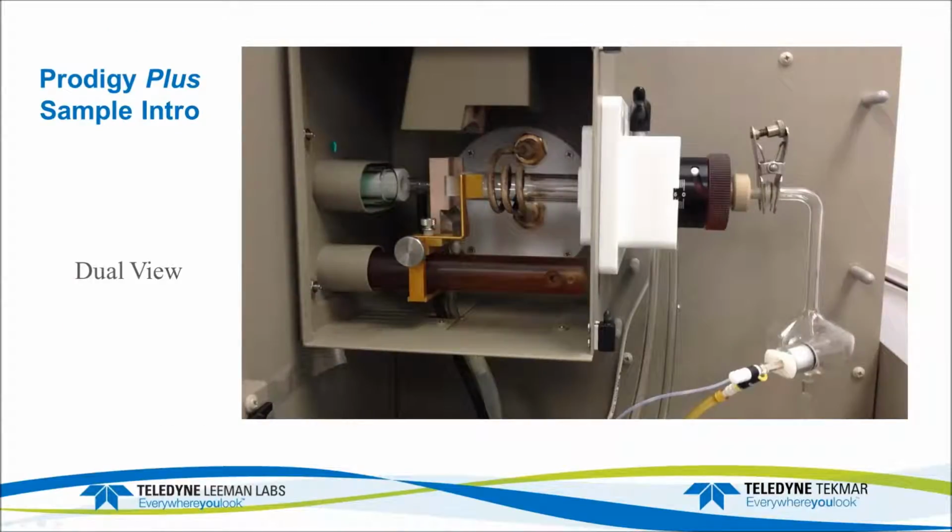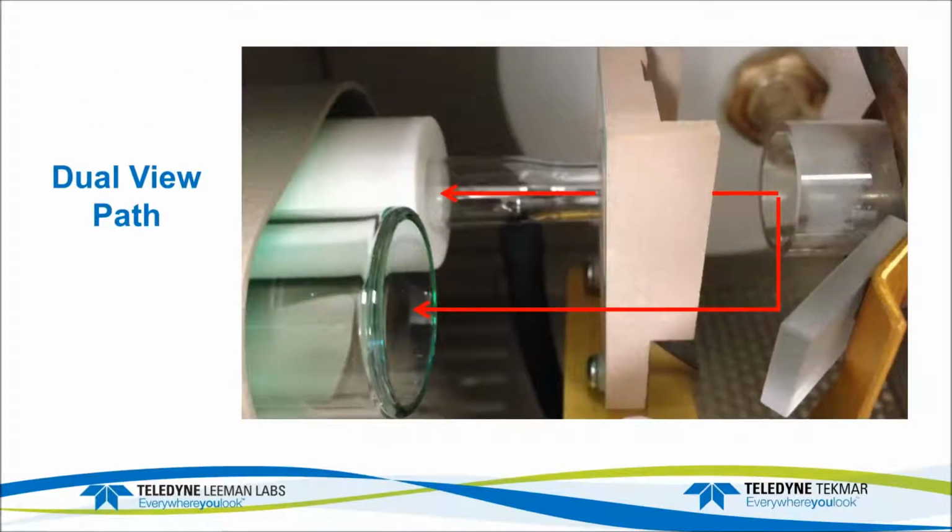This is an example of the sample introduction system, and if you can see where the torch goes into that white plastic block, there's a scale there that allows the positioning of the torch to be repeated from day to day from different operators. When the torch is replaced or removed, it will automatically do all the gas connections, so you don't have to worry about connecting up. There are no torch arms to break, and you cannot connect the gases incorrectly.